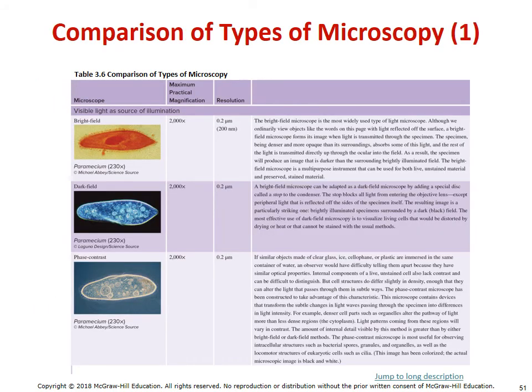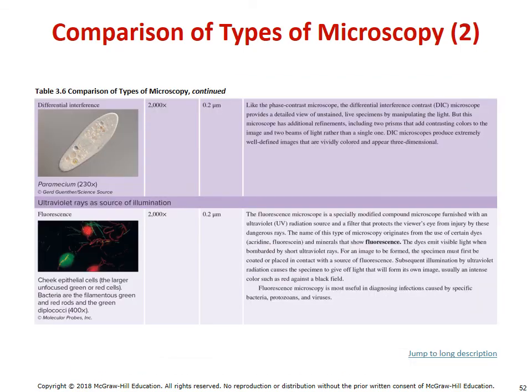So you can see here a bright field microscope and then the dark field microscopy. The difference is really the background and the light that we're collecting in the eye. The idea here is in bright field, there's lots of light in the background that can actually decrease clarity along the edges. In dark field, you actually get greater clarity around the edges because you're not collecting the light from the background. Phase contrast, we don't really care much about, nor do we really care much about differential interference.